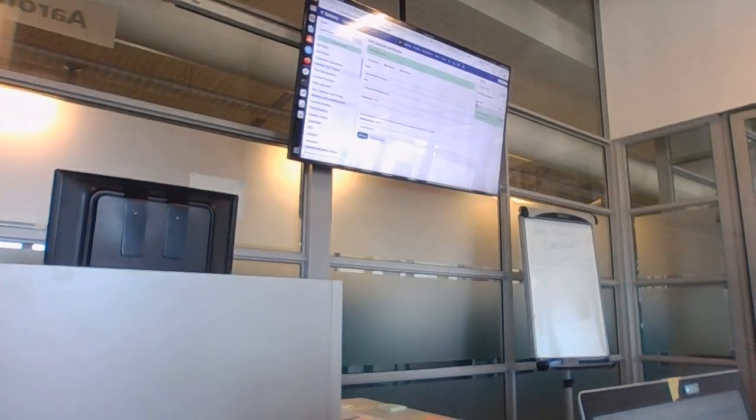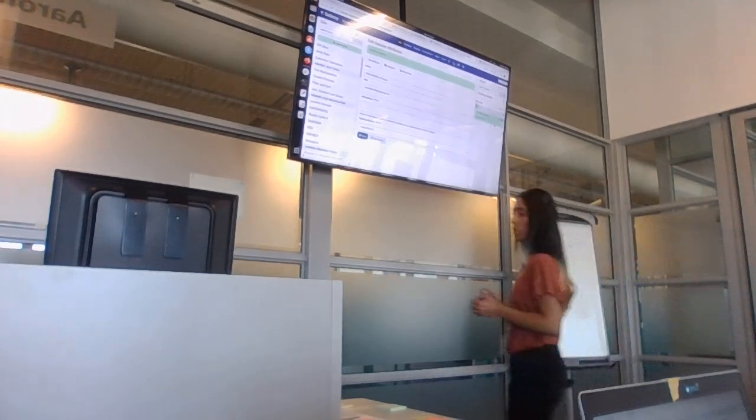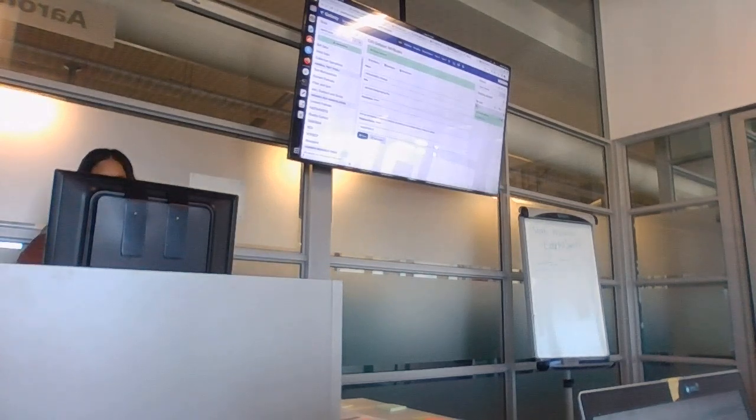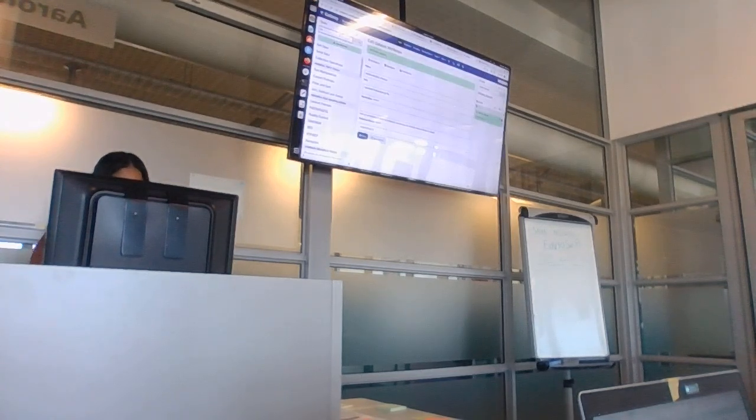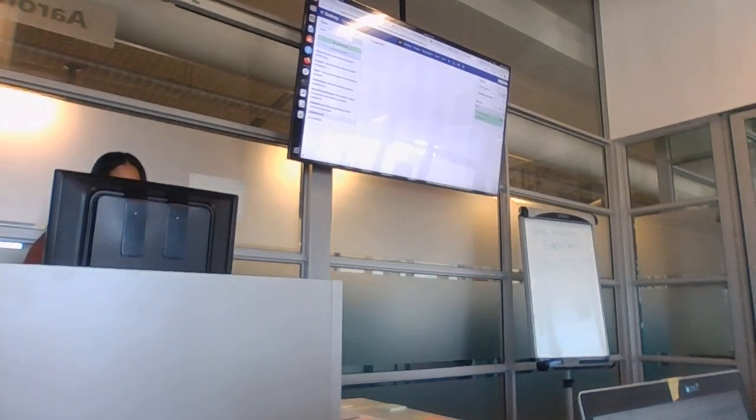Do you remember? Okay, so go to your Galaxy. On this dataset, you want to run the FastP tool. Right? Where would you find the tool, the FastP tool? Yeah, so search for FastP. FastP like this. Search for FastP and you're going to run your analysis on FastP.